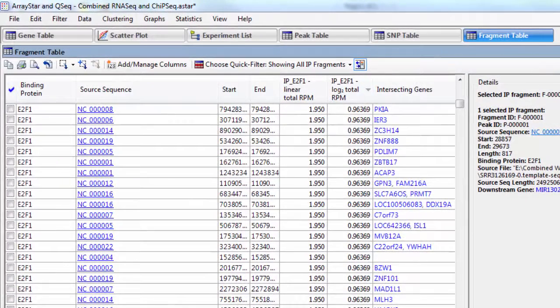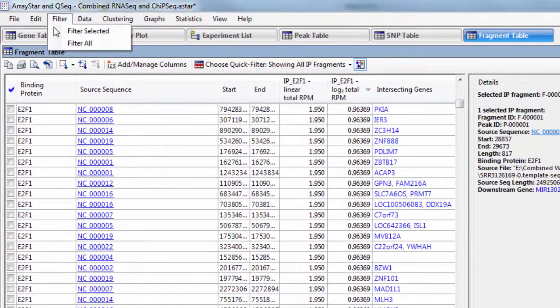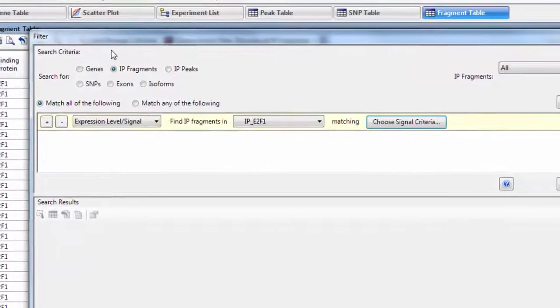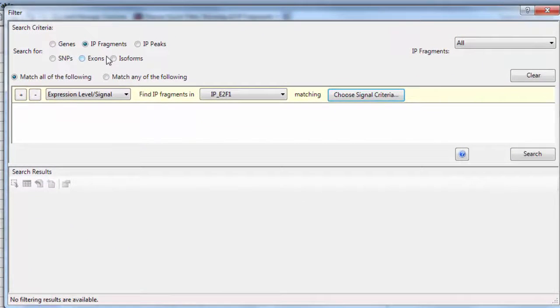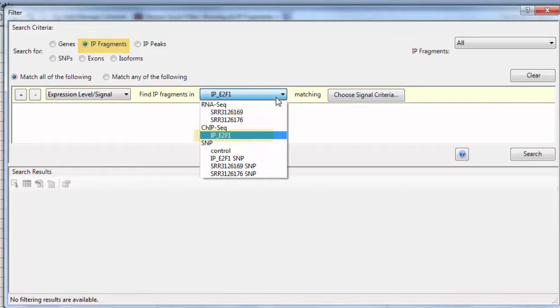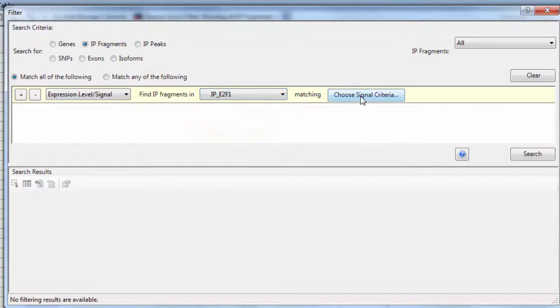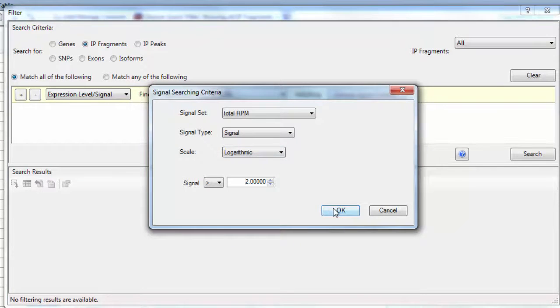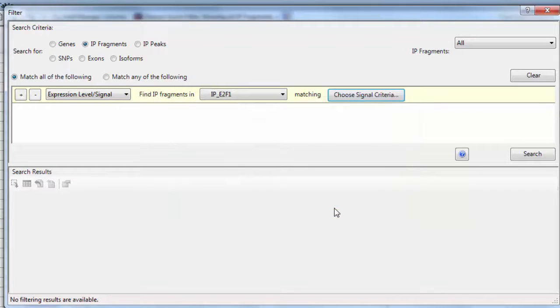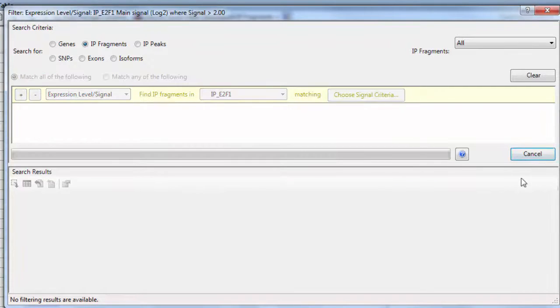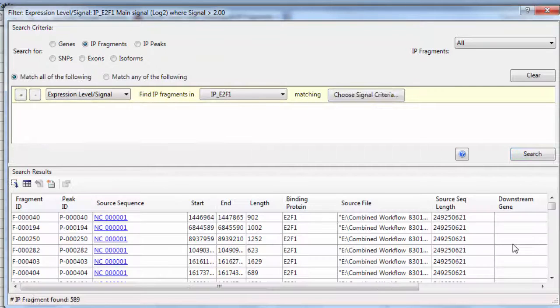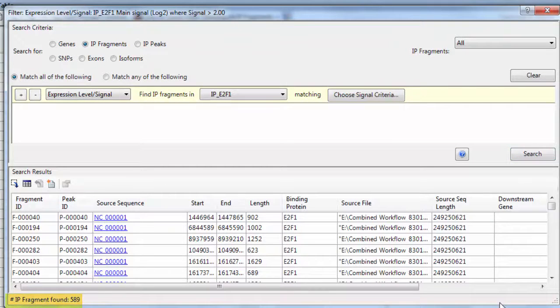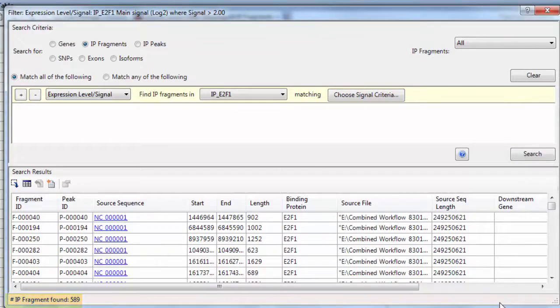Now I need to filter this data, so I'll go to Filter, Filter All, and we will look for IP fragments in our ChipSeq experiment with the log signal greater than 2. I'll click Search. And you can see that ArrayStar found 589 fragments that met that criteria.